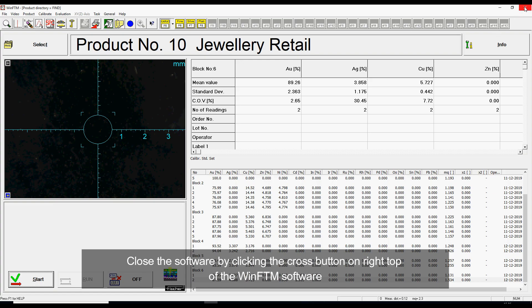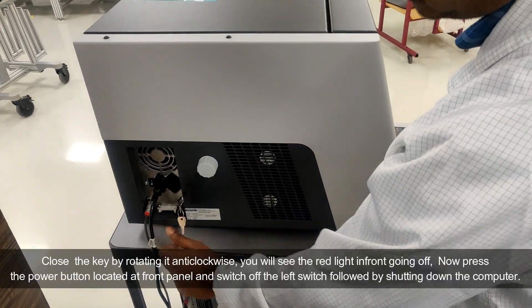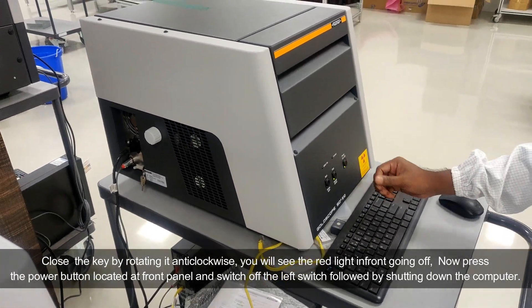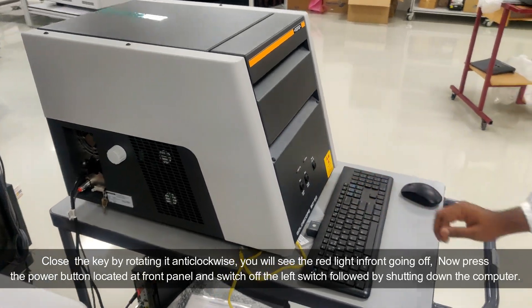Close the software by clicking the cross button on the right top of the WinFTM software. Close the key by rotating it anti-clockwise — you will see the red light at the front going off. Now press the power button located at the front panel and switch off the left switch, followed by shutting down the computer.